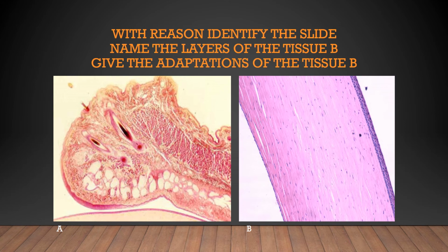So the cornea is transparent, and that's because it's avascular. The main contributing factor is that it's avascular. It's nourished by diffusion from the aqueous humor. And the cornea also has a greater refractile power than the lens.